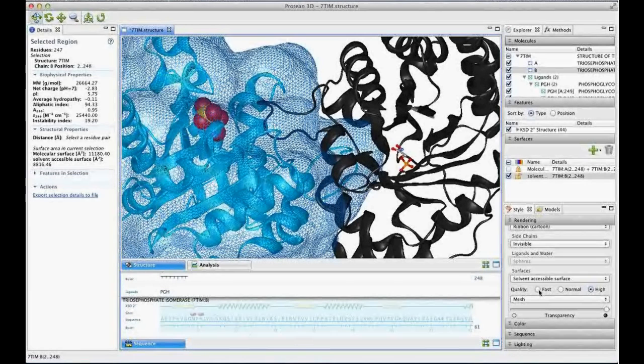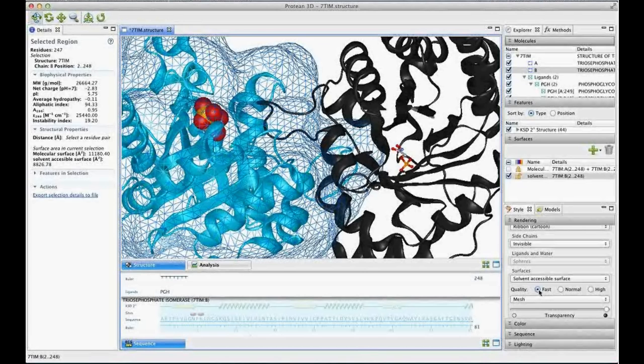Great, thank you. And so far, the whole demonstration has been using a PDB structure file. But we had a question come in. Let's say you're working with a DNA file in Lasergene, perhaps SeqBuilder or another application, and then you translate that to protein. Could that translated sequence be opened in Protean 3D, and then what kind of analyses could you do in that case?